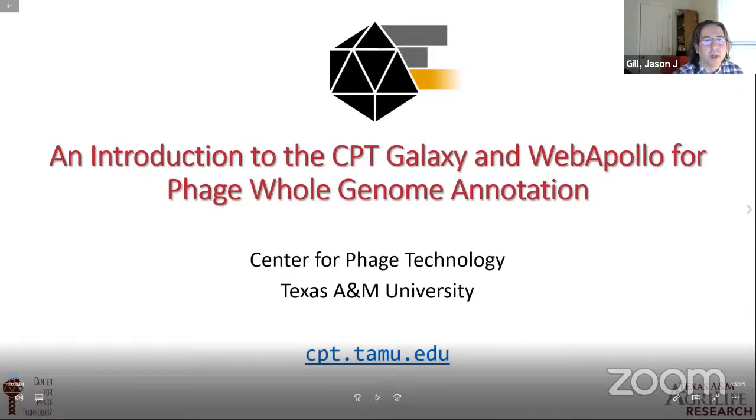And rather than doing a live talk, what we decided to do is to stream basically some of the training videos that we have just finished creating, which describe our Galaxy and Apollo based Phage annotation platform. So we've been meaning to make these videos for a little while, and this kind of spurred us to actually get them finished. So this is actually the first 3 videos in a series that will basically introduce the concepts of the Apollo Galaxy system and just give an overview. This is not going to give you a lot of step-by-step, how to annotate a phage in here. It's an overview of the system.